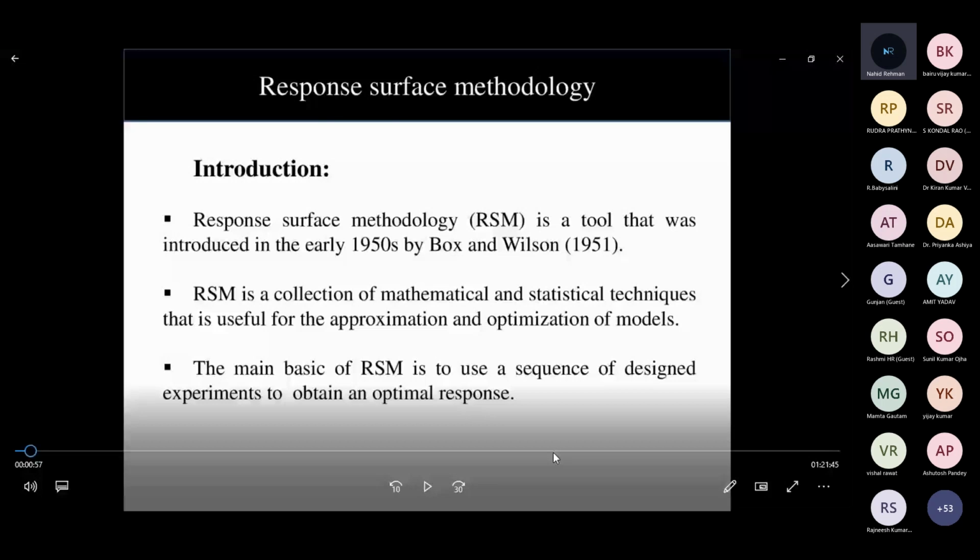Then third, if you consider that I have to optimize the substrate concentration also. Suppose the substrate is lactose, for example, then you will vary the lactose concentration step by step, and then you will find out which lactose concentration, maybe 2% or 3%, is the optimum lactose concentration. Then you will find out I have now three parameters optimized: one is temperature, other is pH, and the third is substrate concentration.